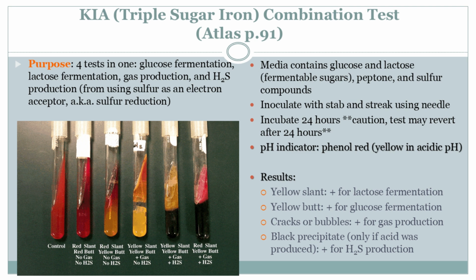Wow. Okay, so we've got these bacterial calling cards, each one telling a story. This is way cooler than I ever imagined. But it makes you wonder, how does this knowledge actually apply? It's not just about identifying the bacteria. It's about understanding what that means, what the implications are. Say a patient comes in with some kind of persistent digestive issue. The doctor could use the test to help figure out what's going on. So it helps them narrow down the potential culprits.